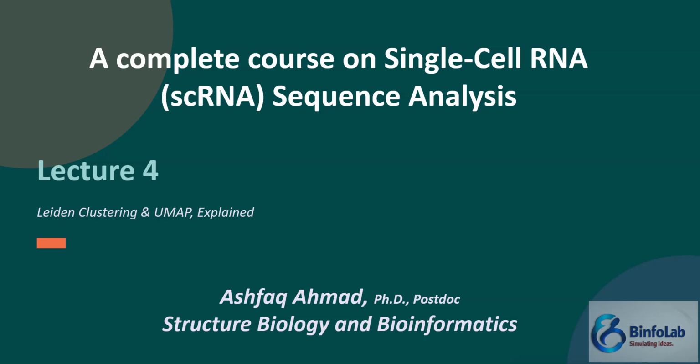If you haven't watched the first three lectures of the series, I would suggest you first watch those three lectures, where we talked about the difference between bulk and single cell RNA, then quality control and normalization, then PCA and clustering. Now, today we are moving toward step 4, that is UMAP and Leiden clustering. So let's start.